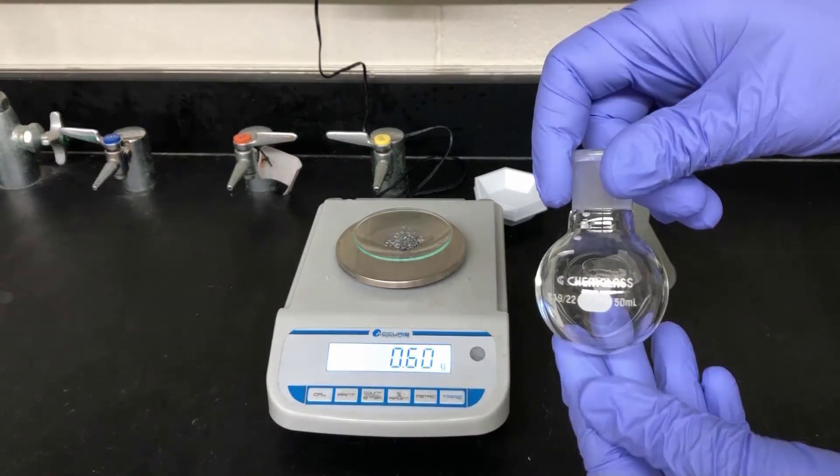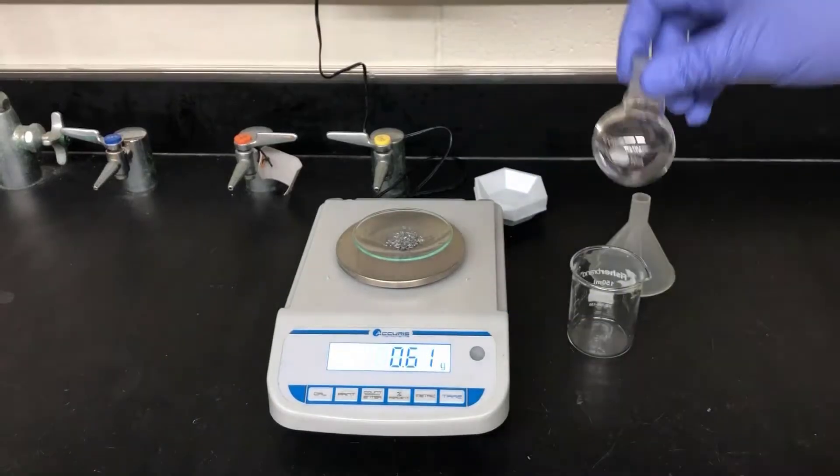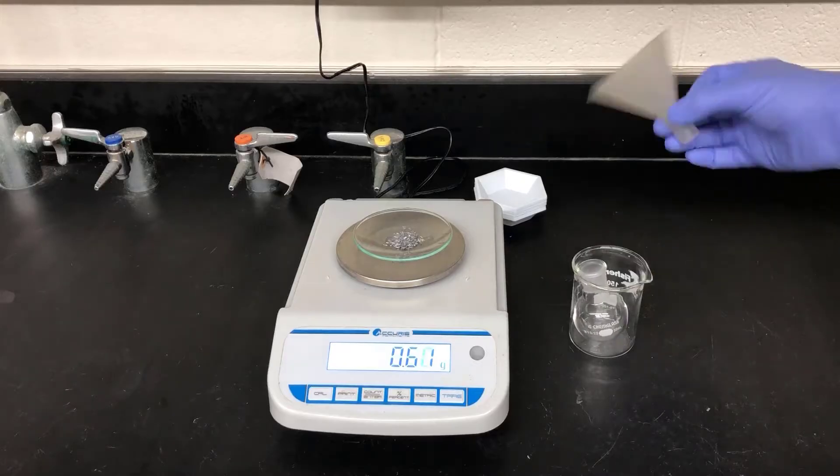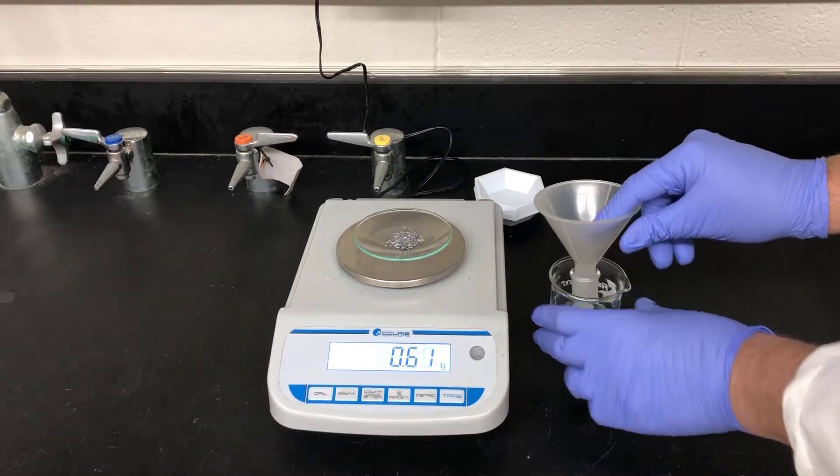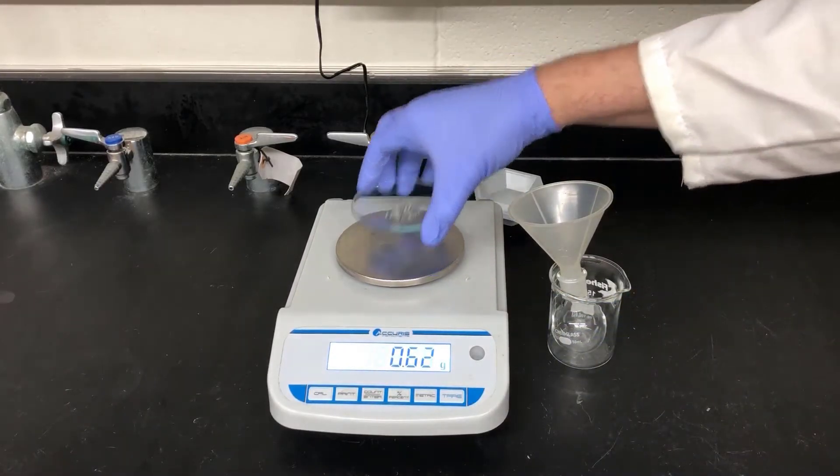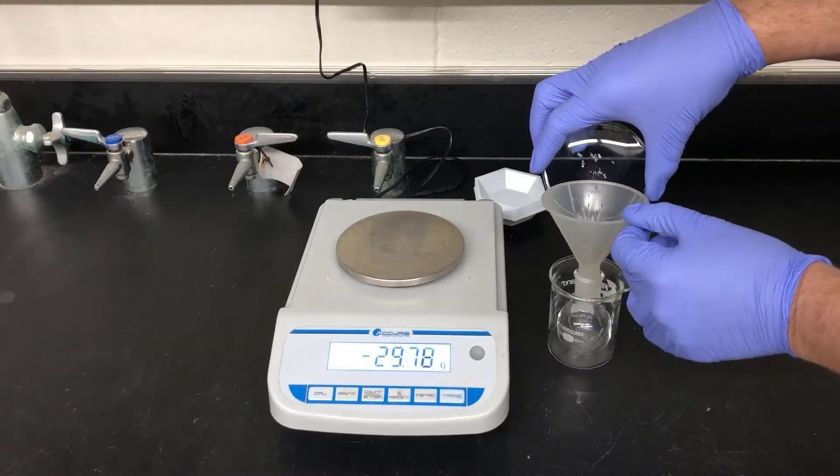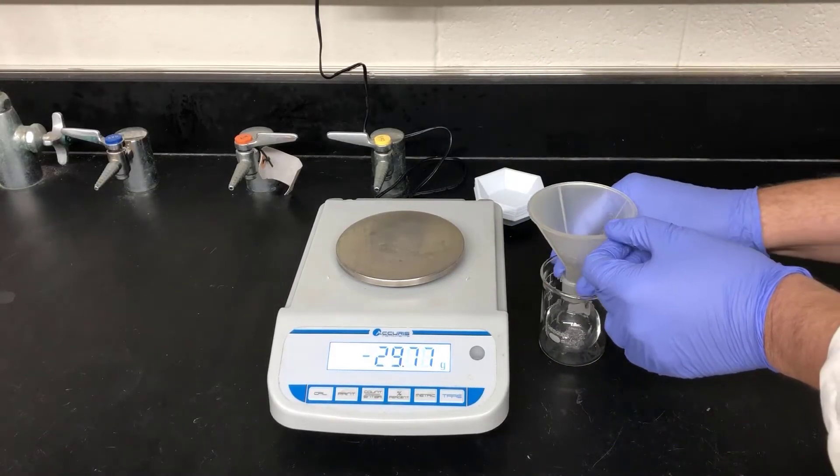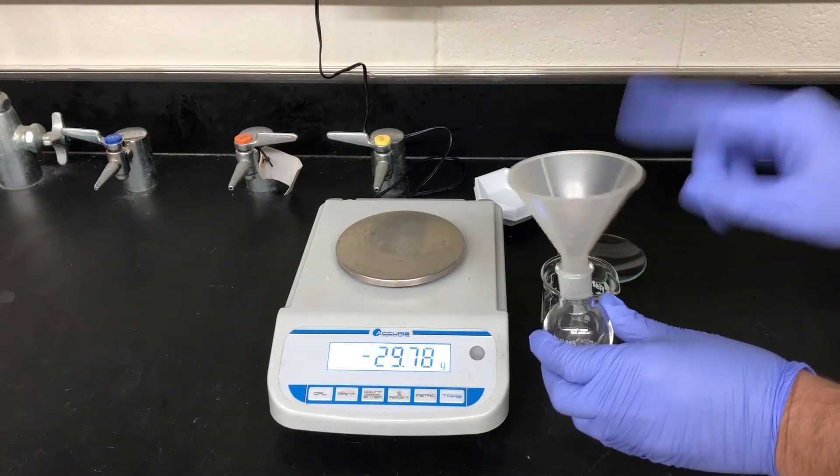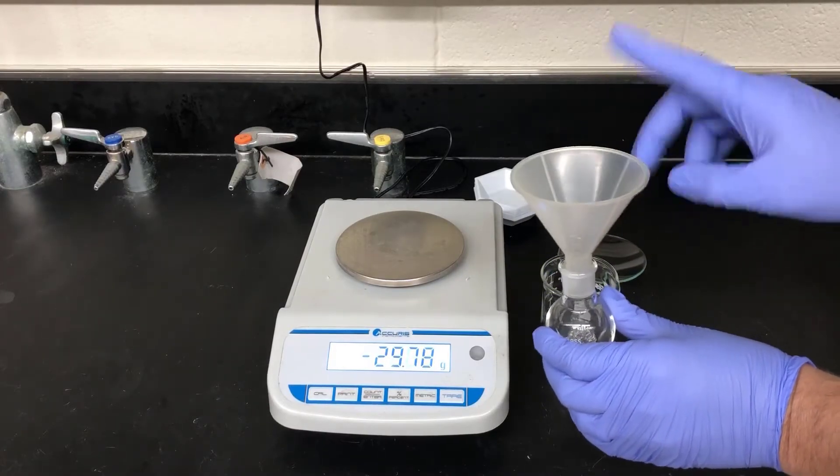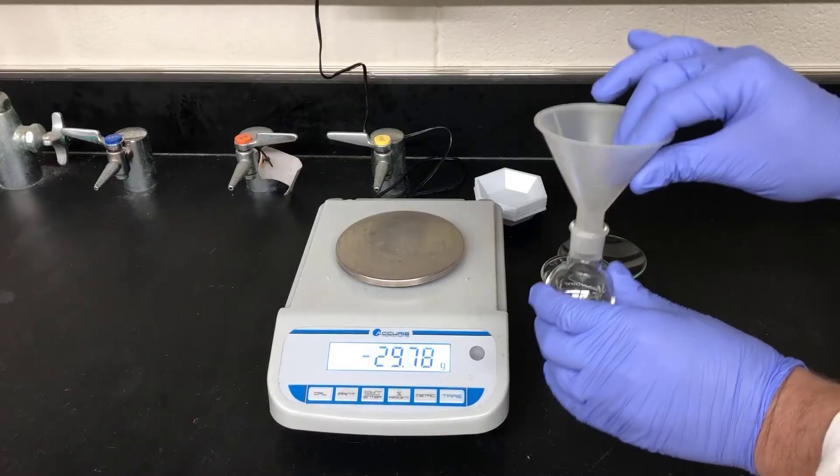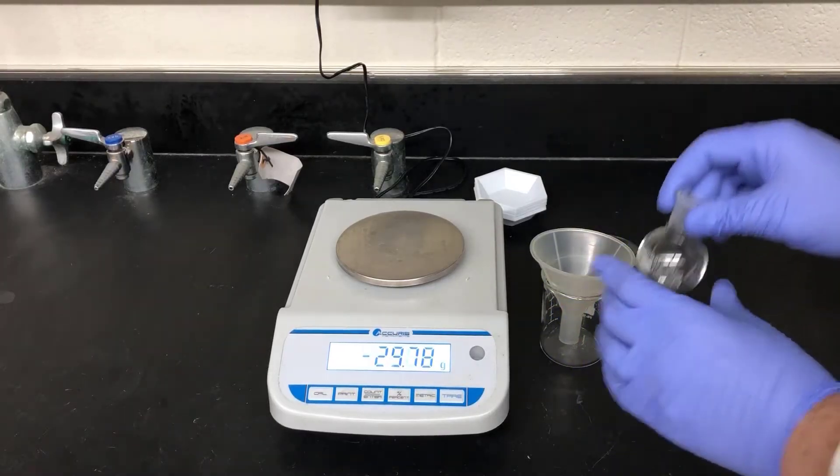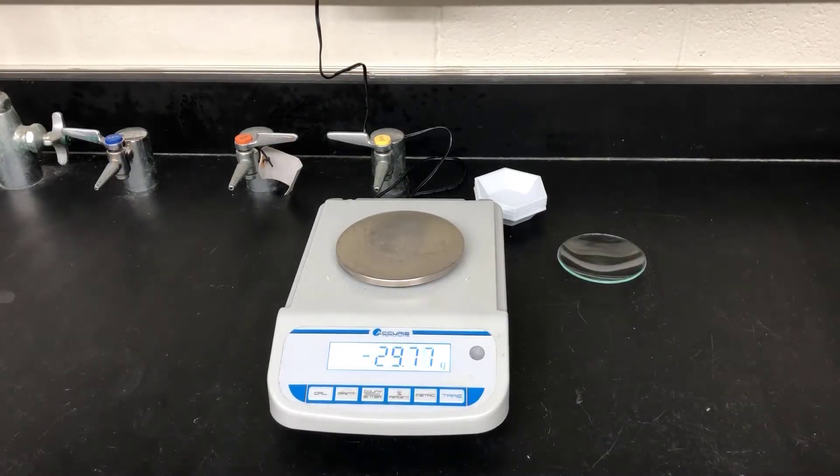I'll be using a 50ml round bottom flask to carry out today's reaction. The Grignard reaction is very sensitive to moisture. Some procedures will even have you oven dry your glassware ahead of time, or flame dry it. I've found that that's not necessary, but it is important that there not be any visible water present on any of your glassware. Make sure that you don't wash your glassware with water immediately before doing this Grignard experiment. It's better to have dirty glassware than have wet glassware.